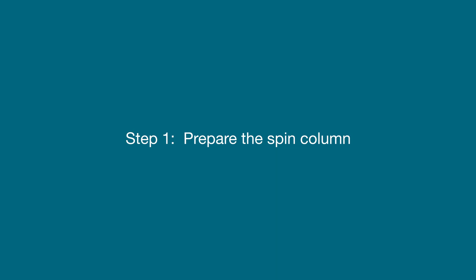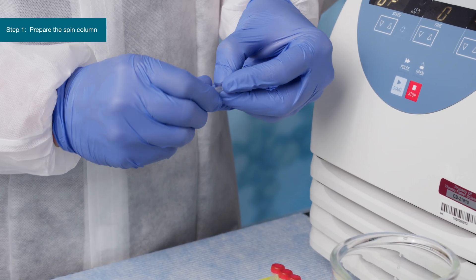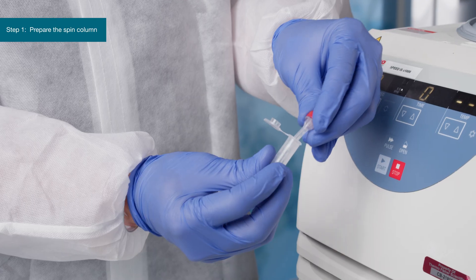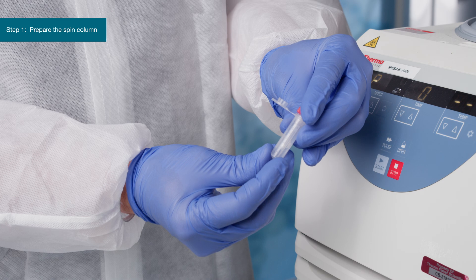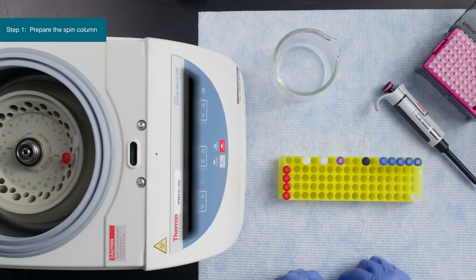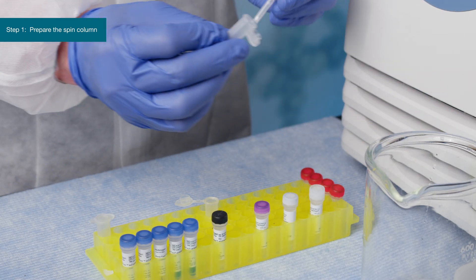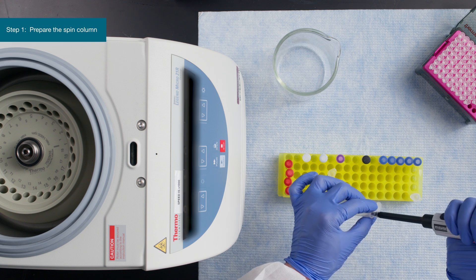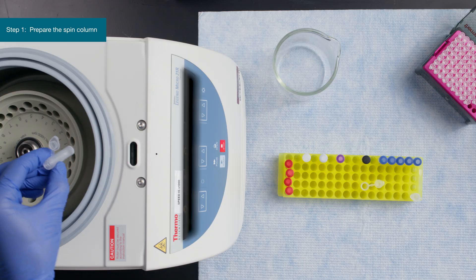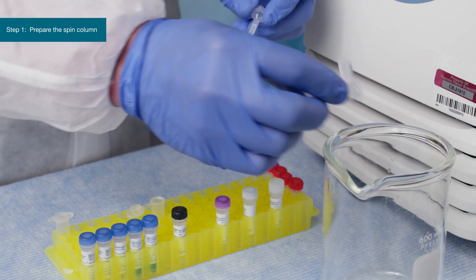The first step is to prepare the spin column. Twist to remove the bottom plug of the column. Loosen the cap, but do not fully remove it. Place the column in a collection tube and centrifuge at 1,000 Gs for 30 seconds to remove the storage buffer. Discard the flow-through. Next, add 100 microliters of wash buffer to the column and centrifuge again at 1,000 Gs for 30 seconds. Discard the flow-through.